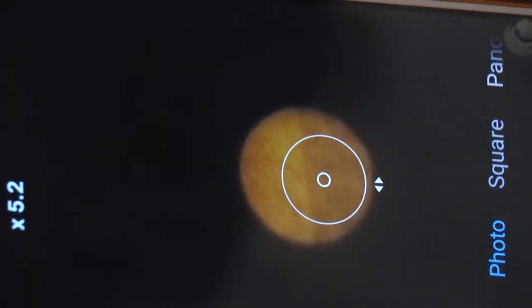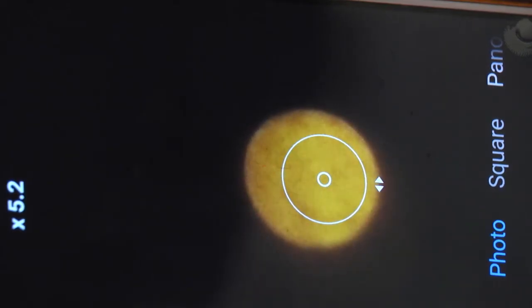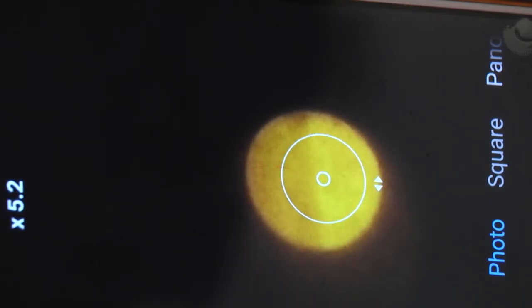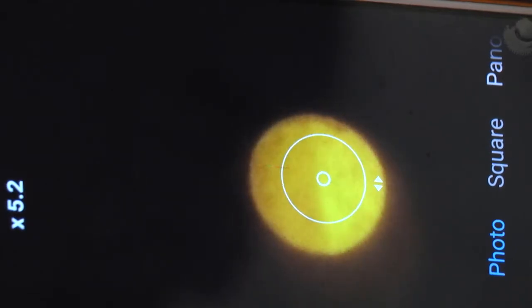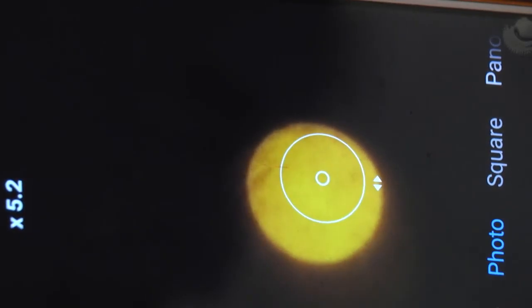Then I am continuing, then I am getting the uniform, okay. Then I am getting another position where this half is dark and other half is bright. If I continue, another uniform position I got, a better uniform.